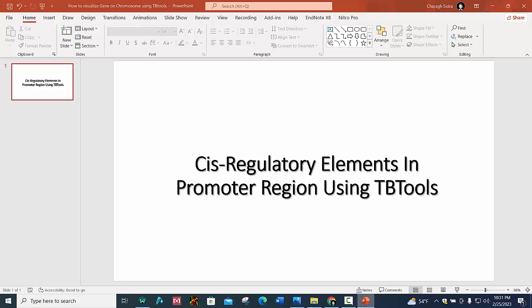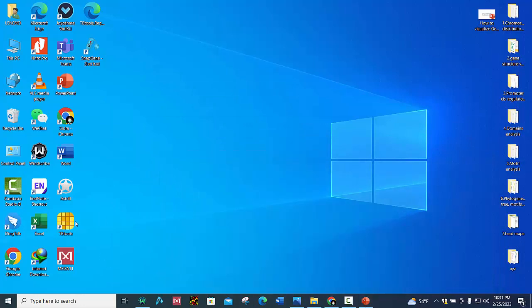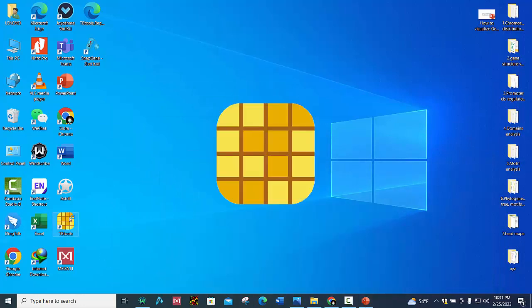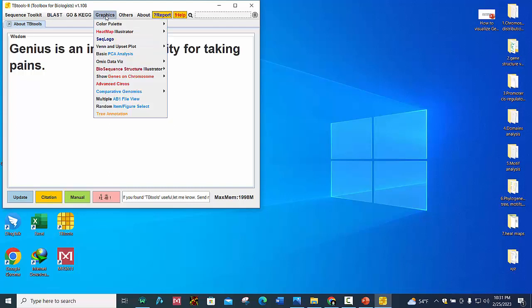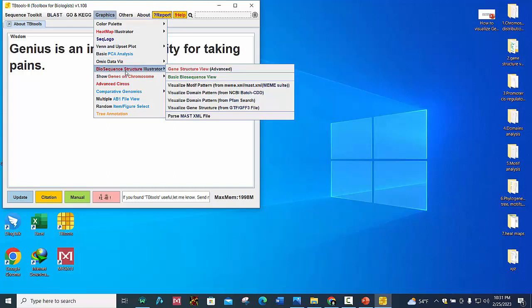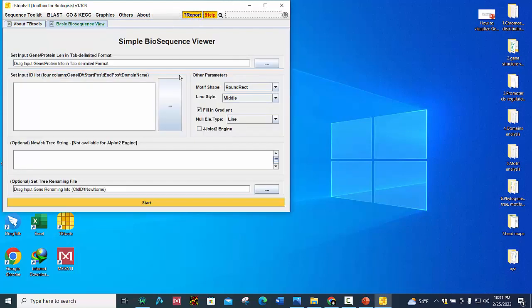First open your TBtools software and go to graphics, click on biosequence structure illustrator and open this basic biosequence viewer. Here you can see we need these three files.